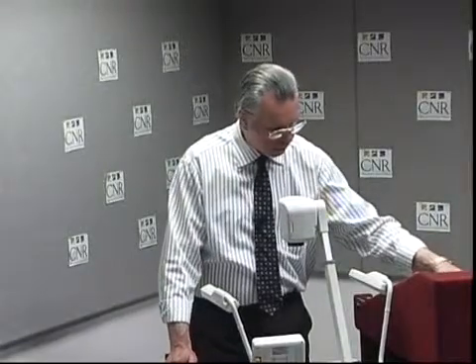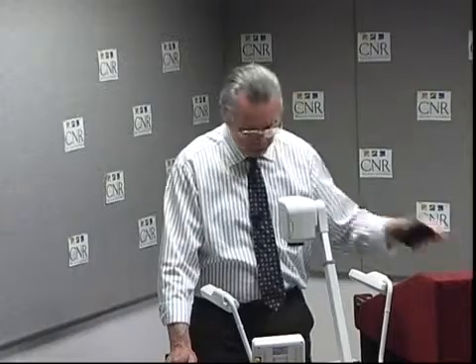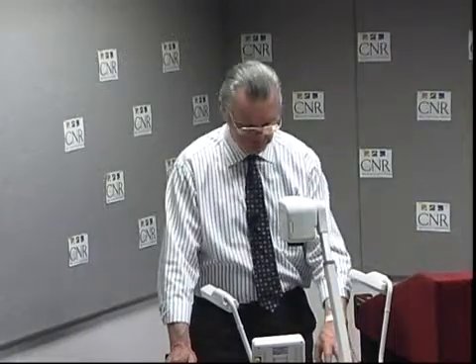And the fact is that we don't use this card in the calibration of the device, but in the original standard it was specified and issued but is not used. The dark dots that you see here are used. And the procedure I showed you during the lecture portion, these dark dots are used to calibrate the scanner and the software.